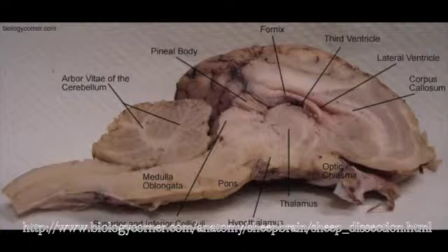The pons is the rounded structure which protrudes just below the midbrain. Composed mostly of fiber tracts, its main function is to help regulate autonomic behaviors such as breathing. It also helps relay sensory input between the cerebellum and the cerebrum. Located below the pons, the medulla oblongata is part of the brainstem and helps to control and regulate autonomic functions such as digestion and heart rate.